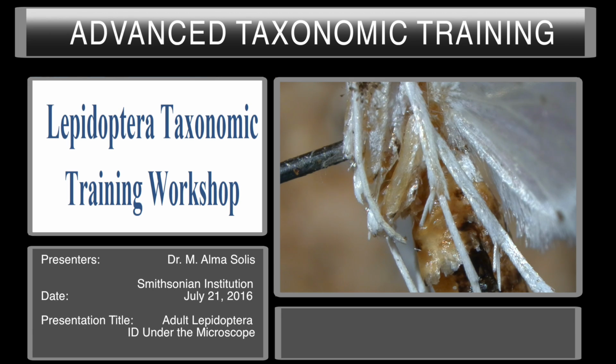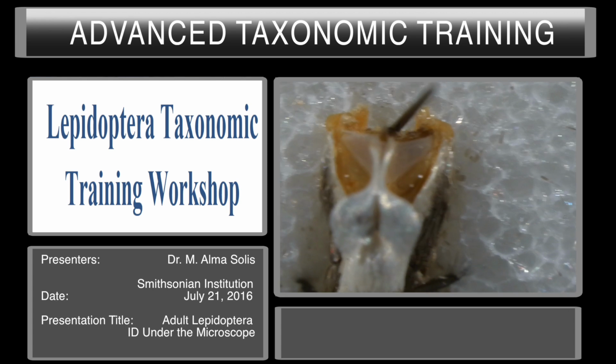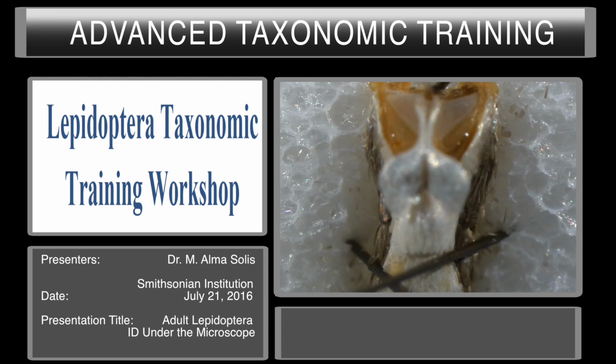This is one of the most difficult areas of the moth to see at all. It can be very furry. It can be mounted so that the abdomen falls. You can't see it. But this is where the tympanum is. You cannot see it very well. So I would suggest that if it is an issue, just pull the abdomen off and you will see either this type of tympanal organ.